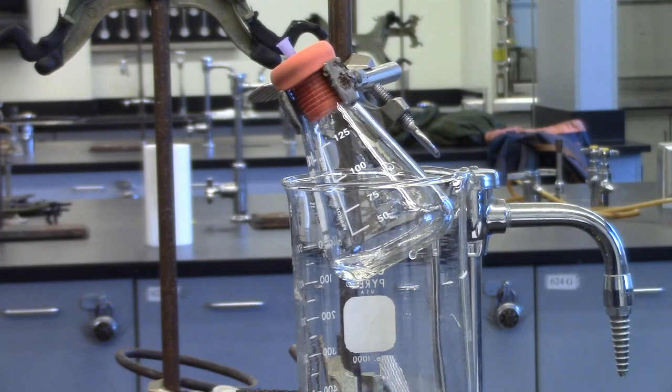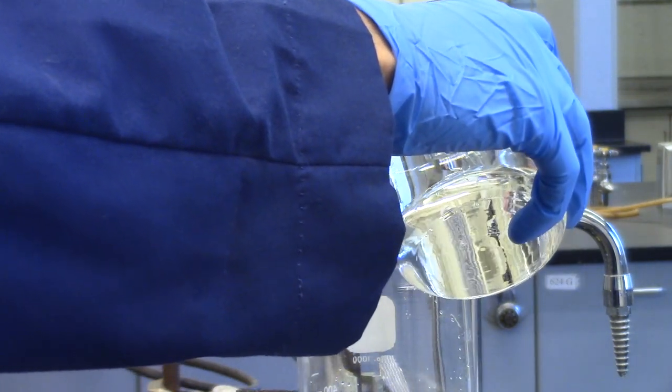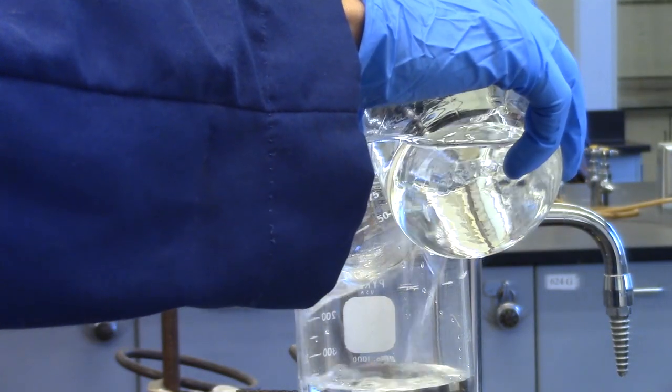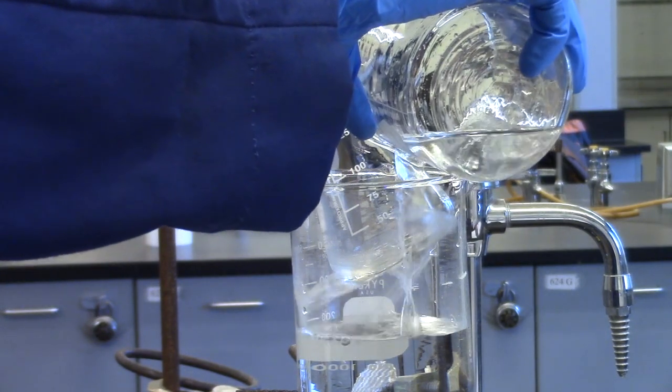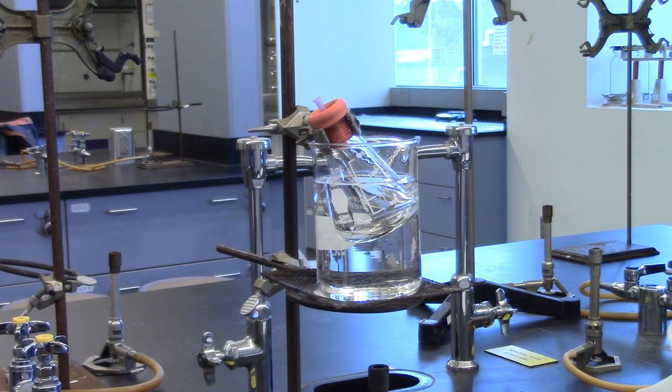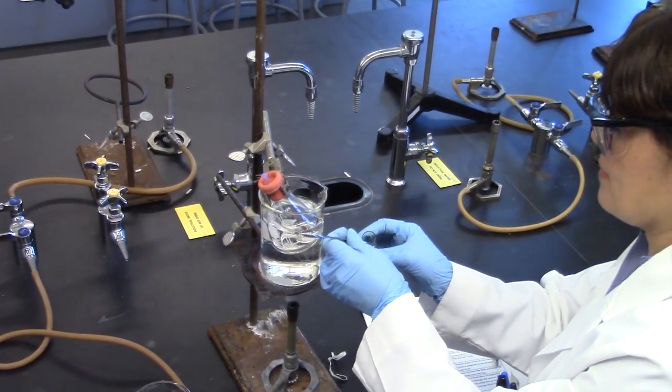Place the flask up to its neck in a large beaker about half to three-quarters full of water. See the illustration in the lab manual. Make sure to secure the clamps tightly. Add three to four boiling chips to the water in the beaker.